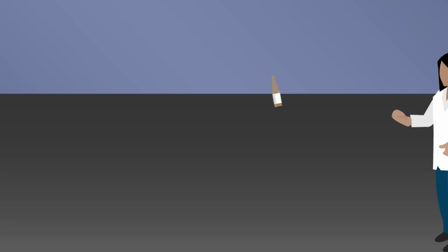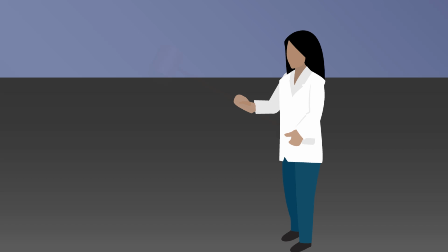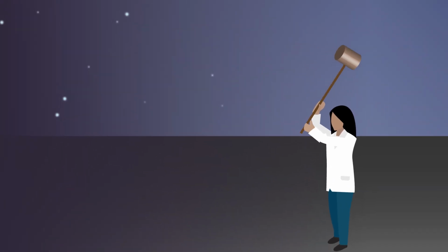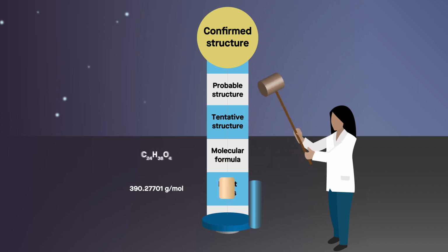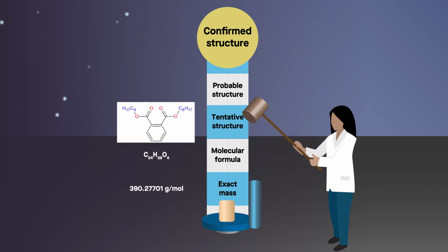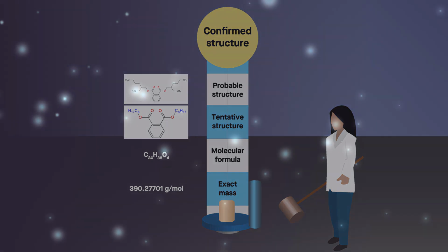When a reference standard is unavailable for chemical confirmation, researchers must take great care in reporting the level of confidence associated with their findings. Thankfully, the scientific community has developed guidance to aid the reporting and interpretation of chemical identifications from NTA studies. For a given NTA experiment, not every observed fingerprint can be assigned a chemical structure.